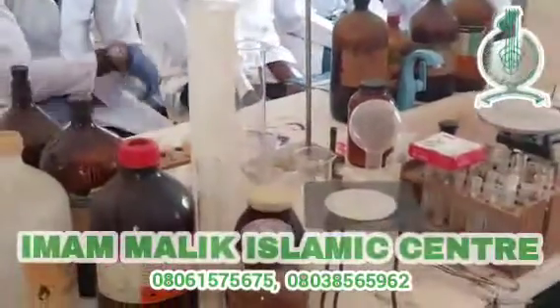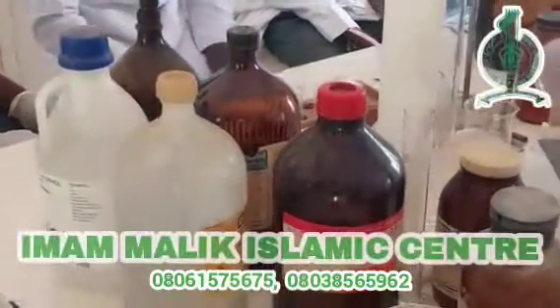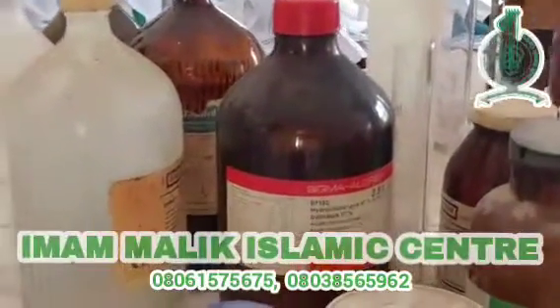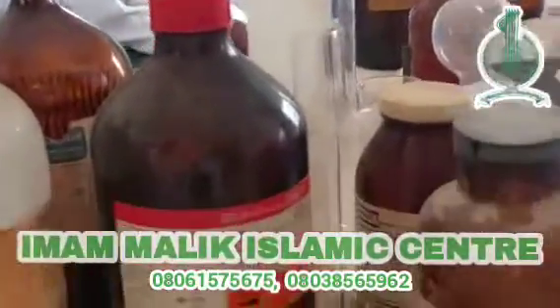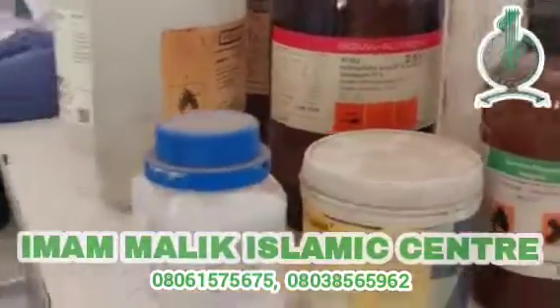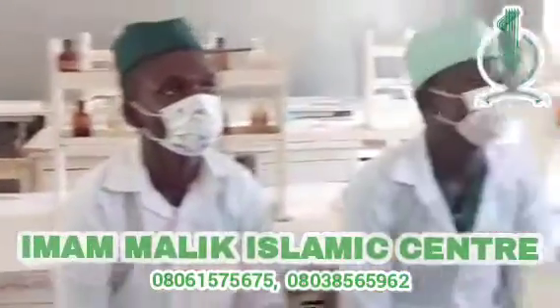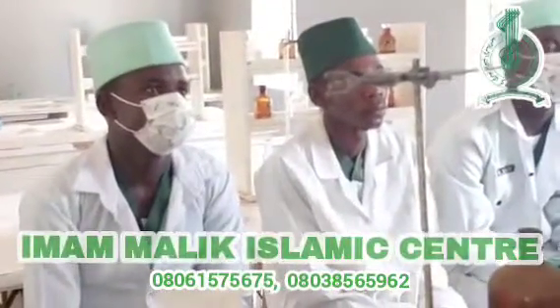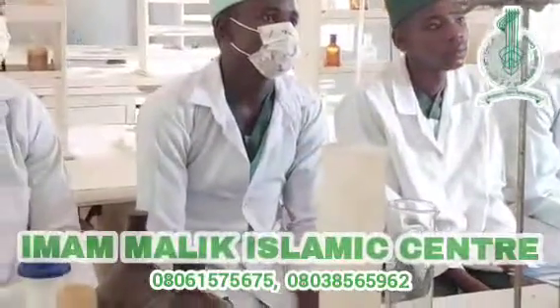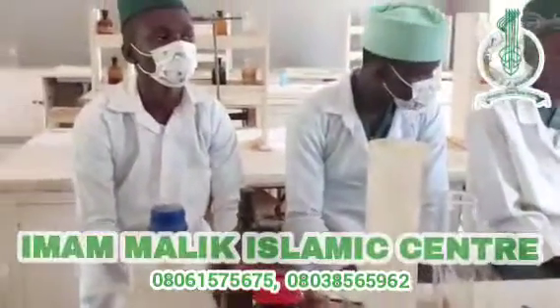So we move to laboratory safety. Laboratory safety is an essential part of ensuring the health and safety of workers and researchers in the laboratory. That is why we are all wearing this lab coat. Because in the case of any accident, first of all, the chemical will not get in contact with the skin directly. So the effect will be reduced by the lab coat, and we pray such should not happen. So you have to be very careful.